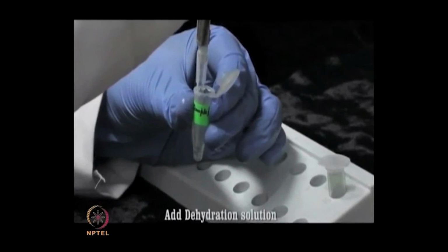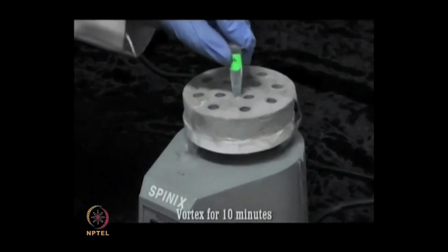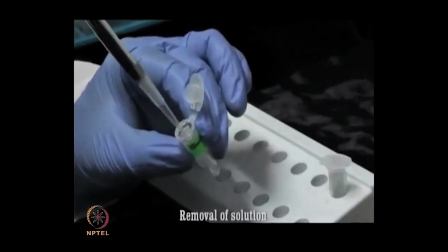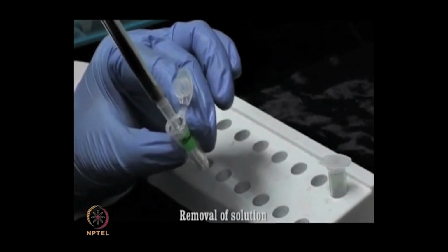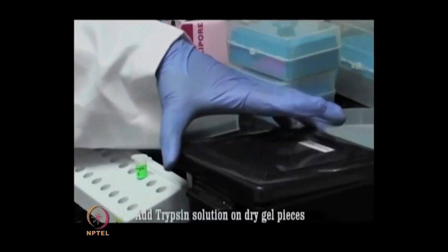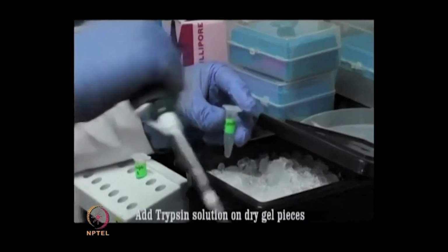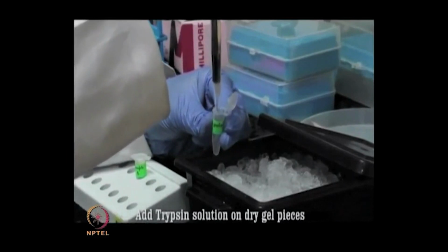Now, add 50 microliter of dehydration solution, mix it properly by vortexing and incubate it for 10 minutes. Again, you need to remove all the solution, air dry the gel pieces and then add 25 microliter of trypsin solution, around 500 nanogram.